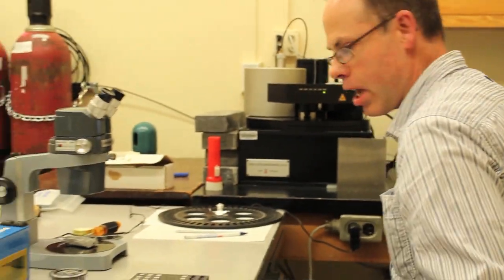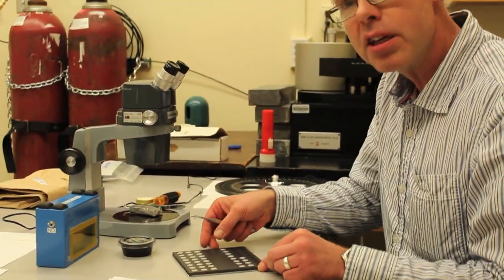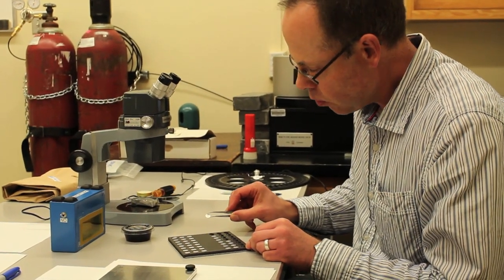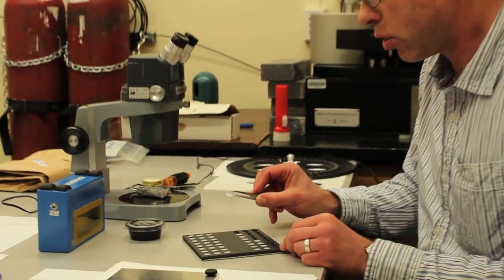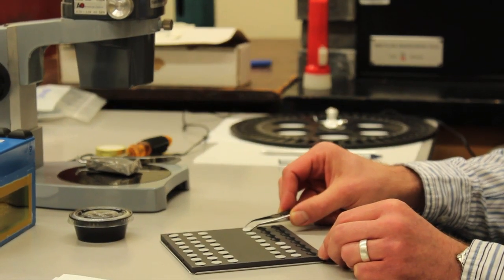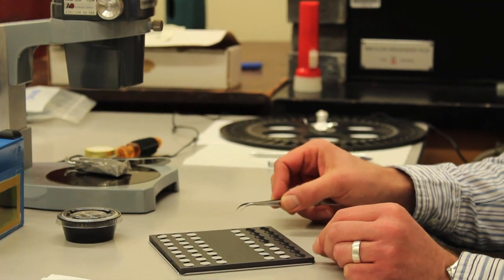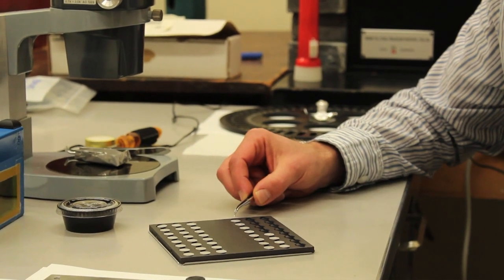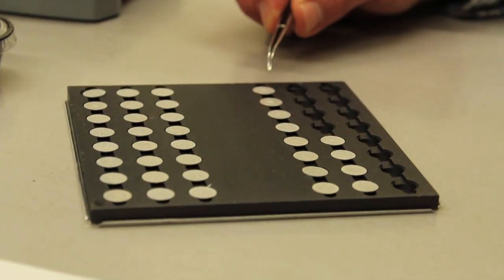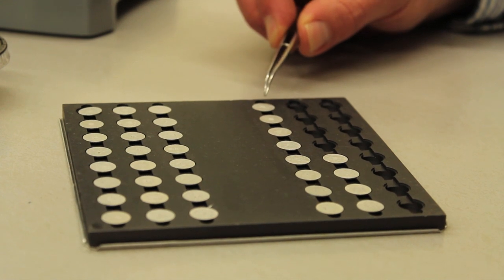Perhaps to understand the physical technique, it would be best if I show you what we actually work with. So we have here some small aluminium discs, and with some silicone oil we've stuck on some grains of quartz. So quartz is a very common rock-forming mineral. It's the most common constituent of clean beach sand, for example. And these grains were prepared from a sediment, and we've stuck them onto these aluminium discs.